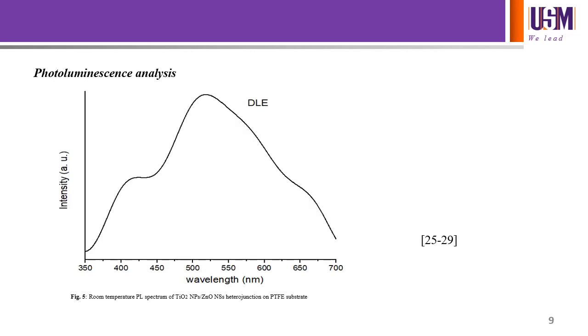Photoluminescence analysis, figure 5, revealed that there was a weak emission peak in the UV region and a broad emission peak in the visible region was observed due to the presence of OH groups. This can contribute to the shift, which is dominated by interstitial oxygen, for the delay of the photodegradation.